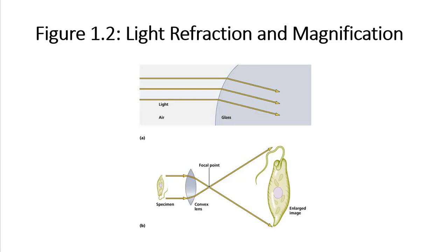If you were in a lab with me, we would talk about it. Basically, we have these lenses, and when you use a microscope slide and a cover slip, they all have to be the same refractive index so that everything refracts together. If you have something of two different refractive indexes, you can't see anything. You have to bend the light all the same way. So that becomes very, very important.